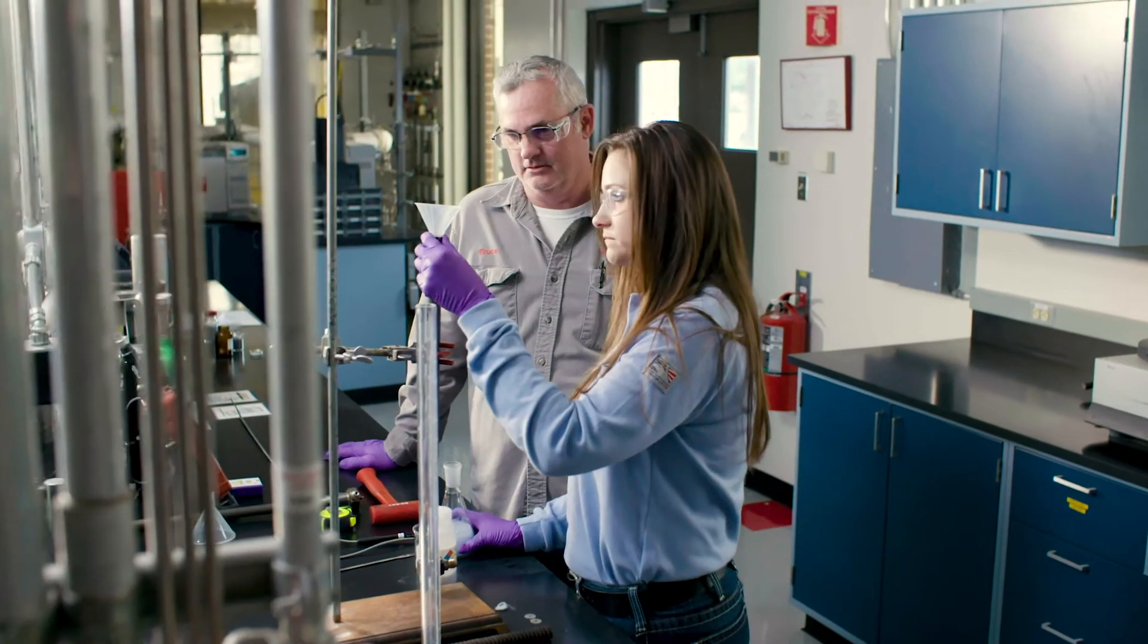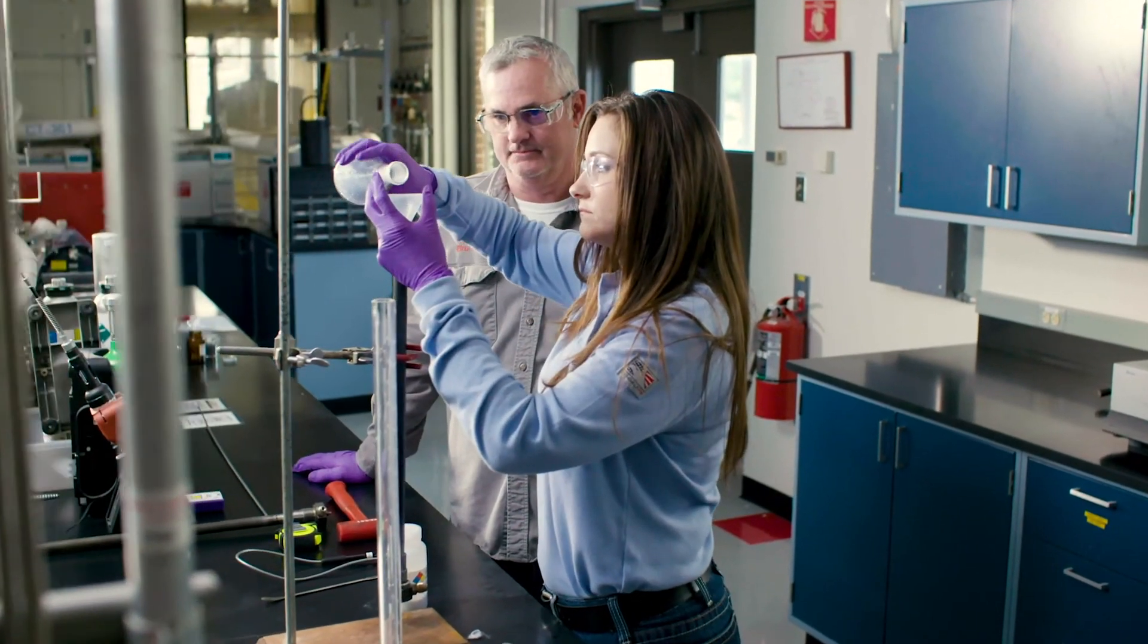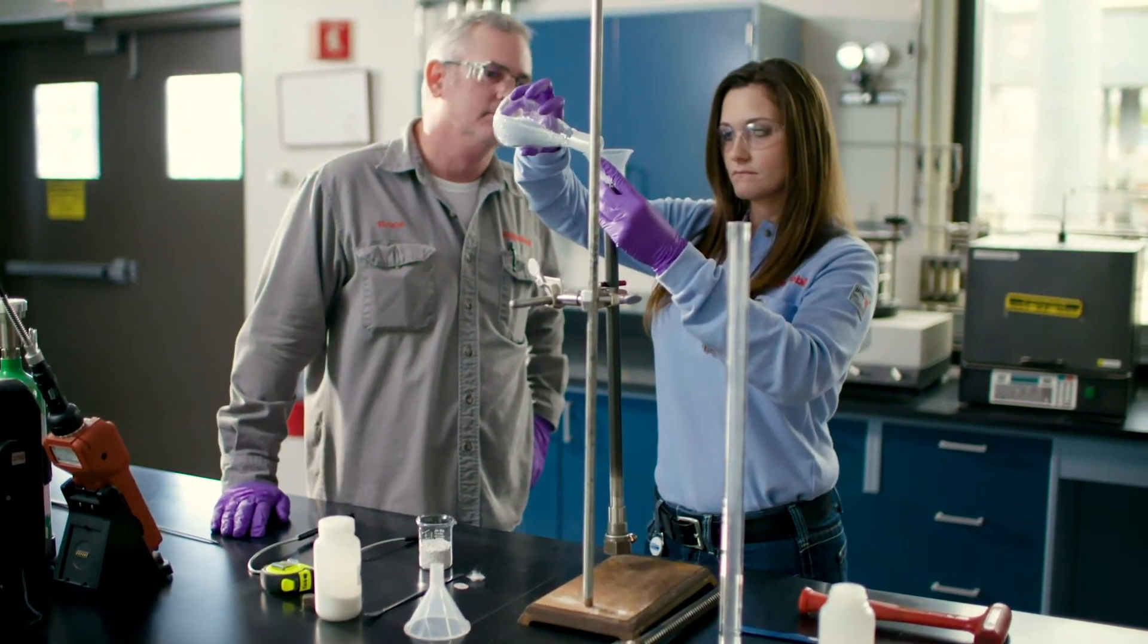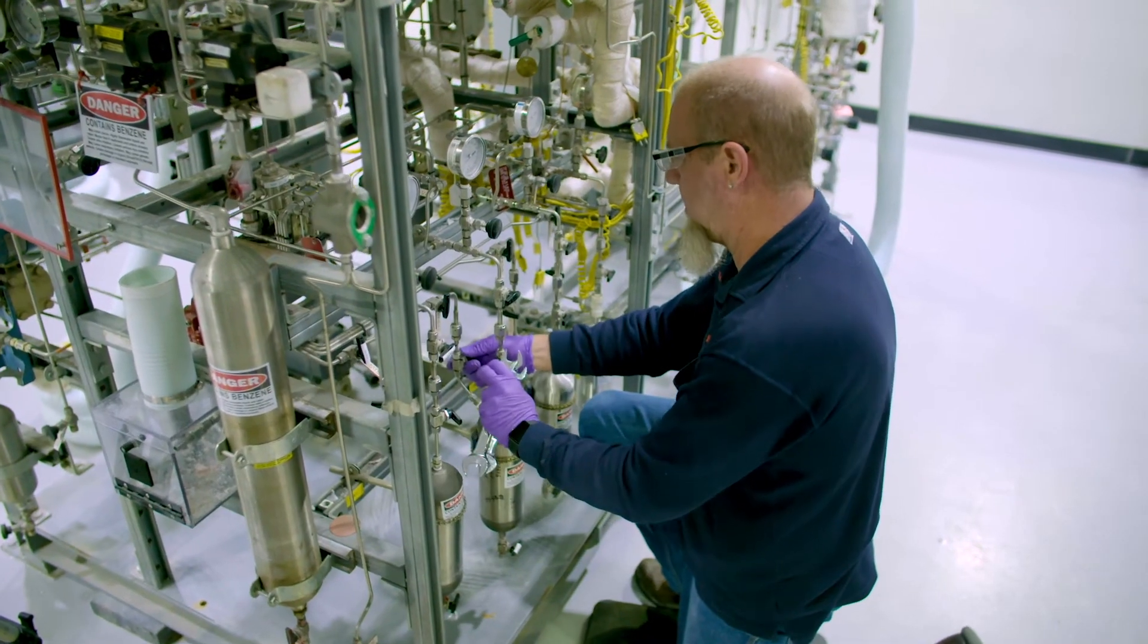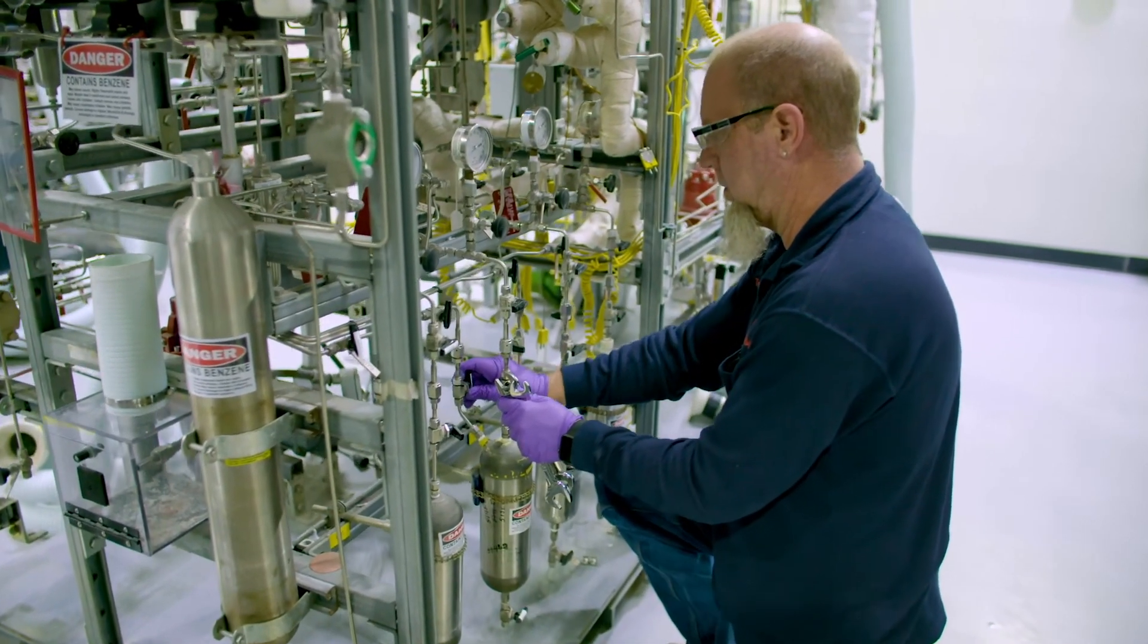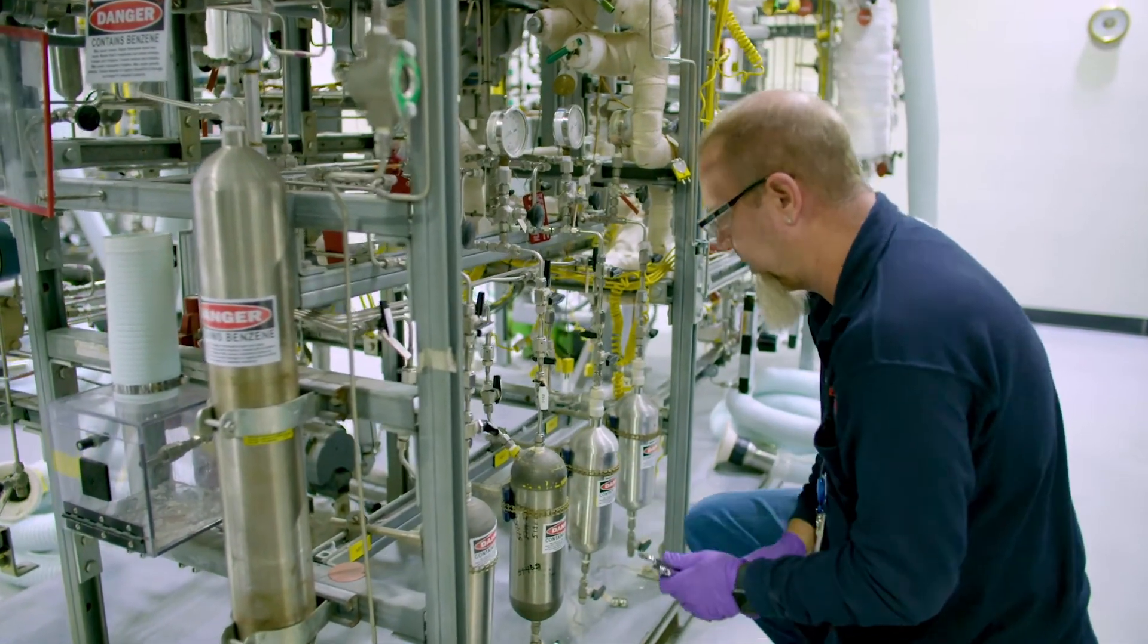Quality control to ensure optimum performance is an important part of our commercial process and is performed at our ExxonMobil Global Chemical Technology Laboratory. Once evaluated, the catalysts are shipped to customers around the world to be used in innovative gas, chemical, and refining processes.